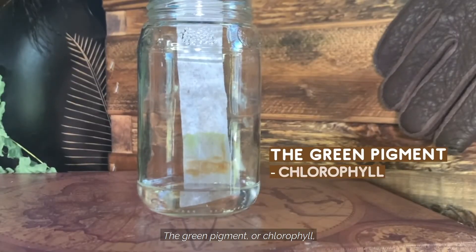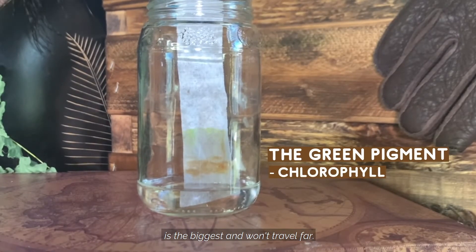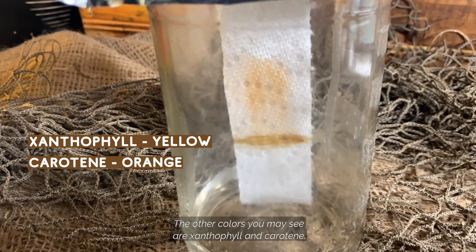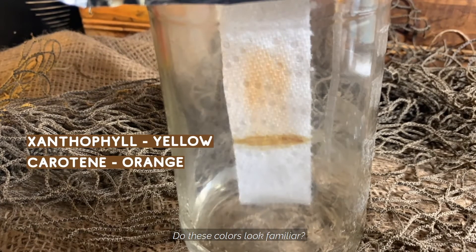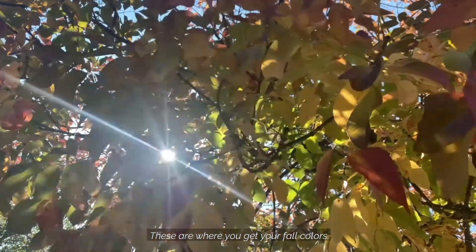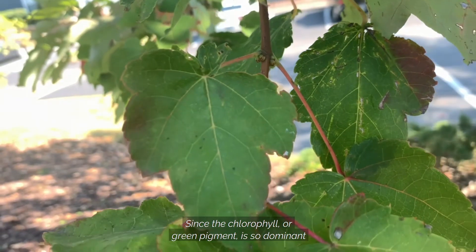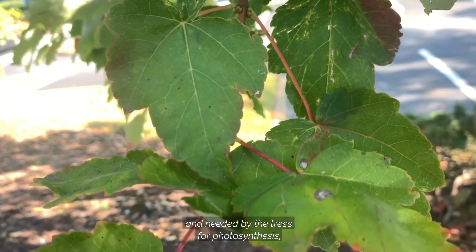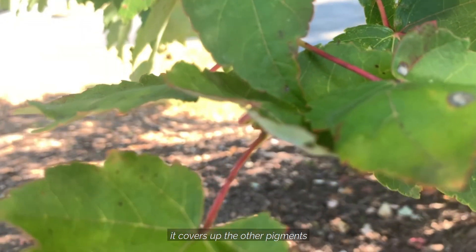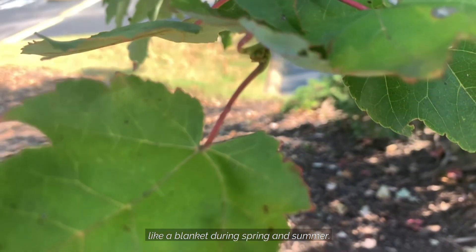The green pigment, chlorophyll, is the biggest and won't travel far. The other colors you may see are xanthophyll and carotene. Do these colors look familiar? These are where you get your fall colors. Since the chlorophyll or green pigment is so dominant and needed by the trees for photosynthesis, it covers up the other pigments like a blanket during spring and summer.